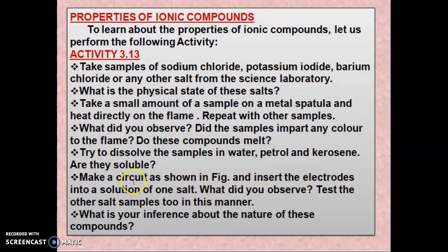Insert the electrodes into the solution of one salt. What did you observe? Test the other samples in this manner. What is your inference about the nature of this compound?